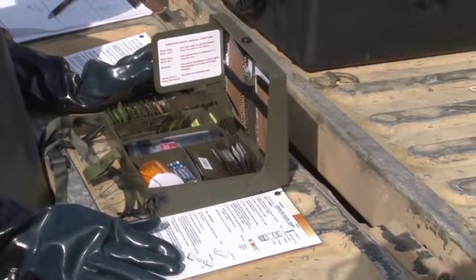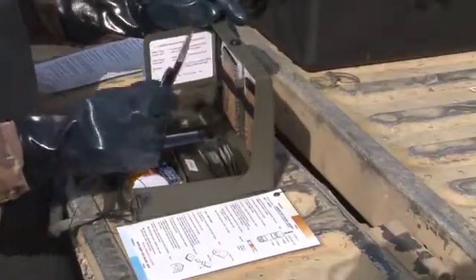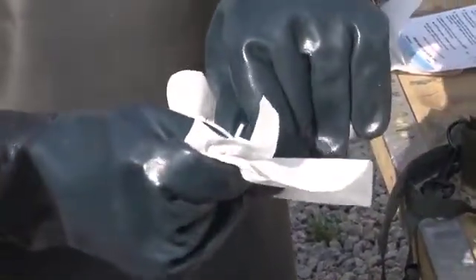You will start by preparing a detector tube. Notice the blue band detector tube packet in the kit. You will take out one tube and then return the packet to the kit. Notice the break marks on each end of the blue band tube. You'll break off both ends of the blue band tube at the break marks.